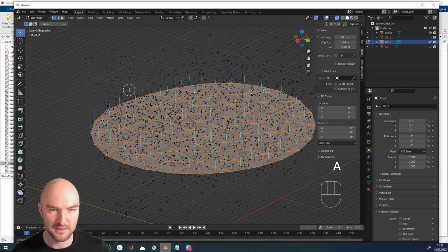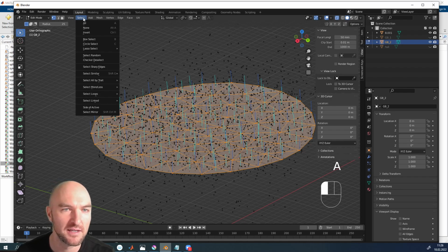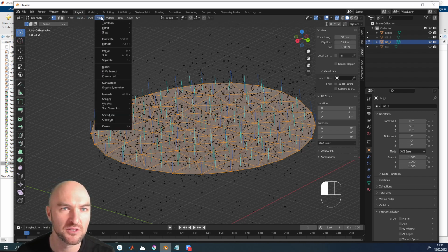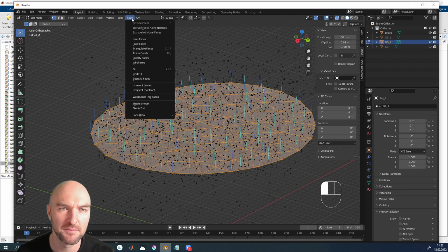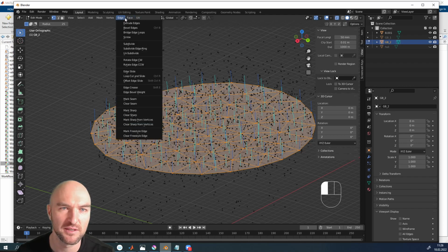So we should obviously select everything. Where has that been moved? We're going to find it.